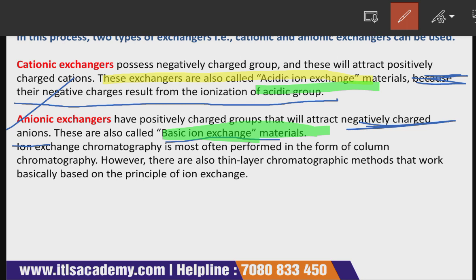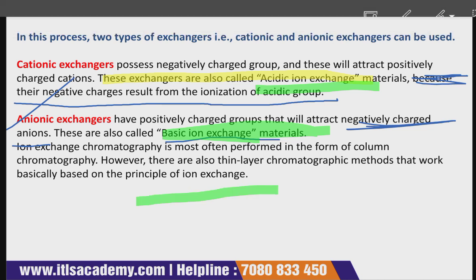If you have studied my previous lectures on chromatographic techniques, you can understand this technique. They basically work just like column chromatography or thin layer chromatography.